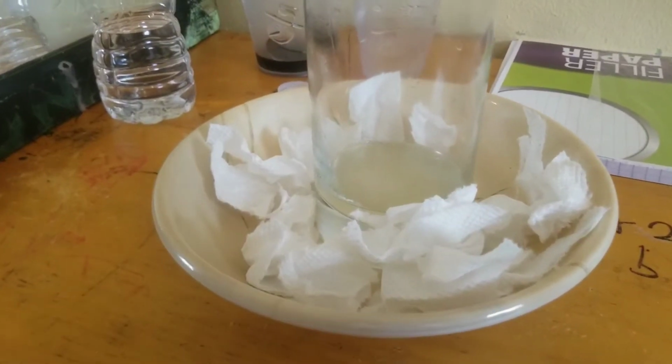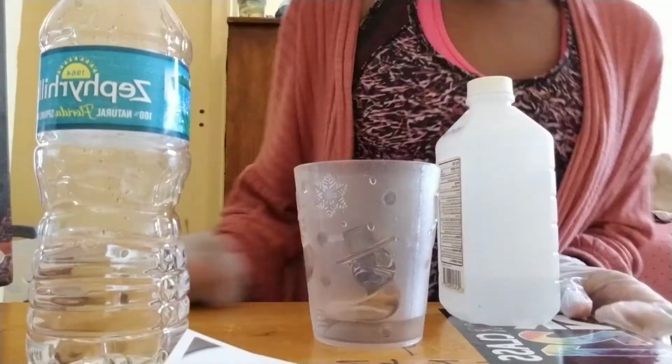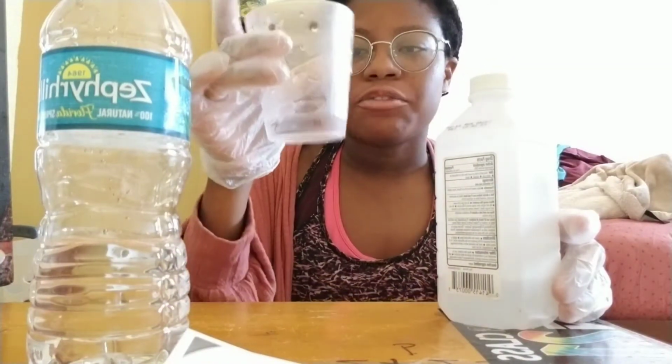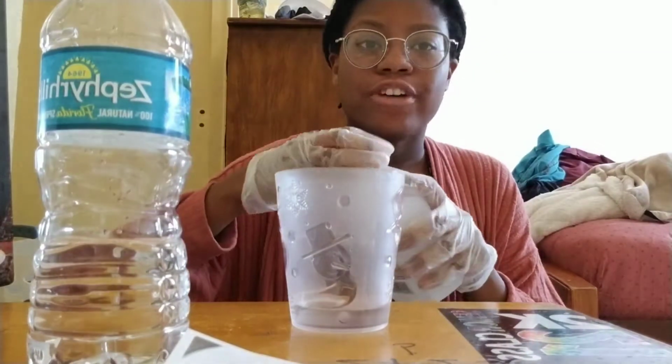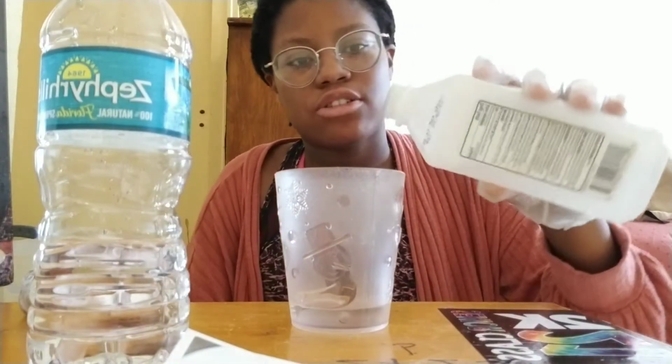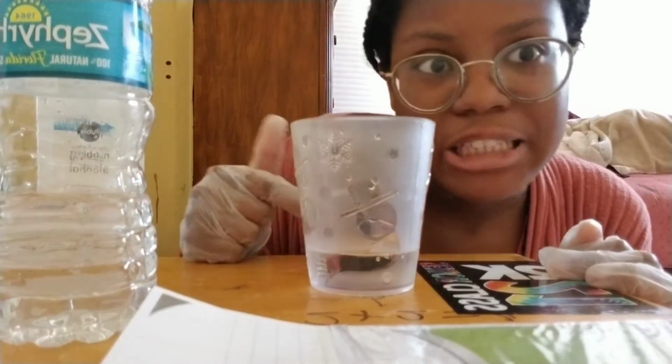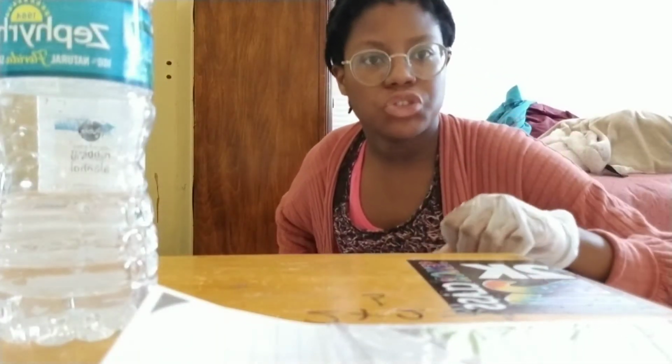And while we're doing that, we're going to be setting up our ethanol/water mixture. We're going to need a 10 milliliter solution. Right now I already have 5 milliliters of water, and I'm going to add 5 milliliters of ethanol to get our 50-50 solution. Then we're going to place this in our ice bath also. The ethanol solution will be used to prep our filtration and everything.